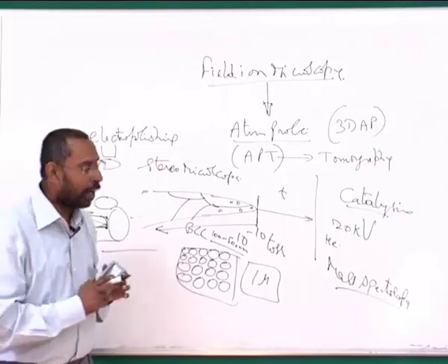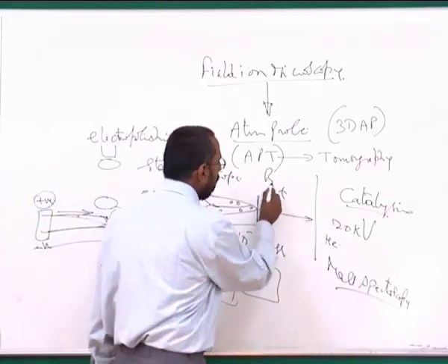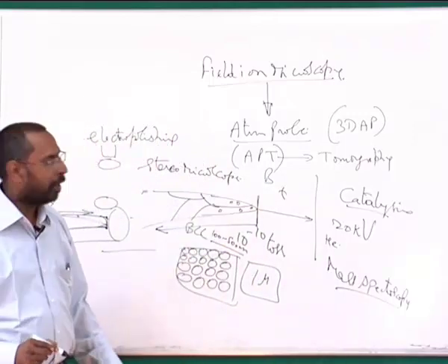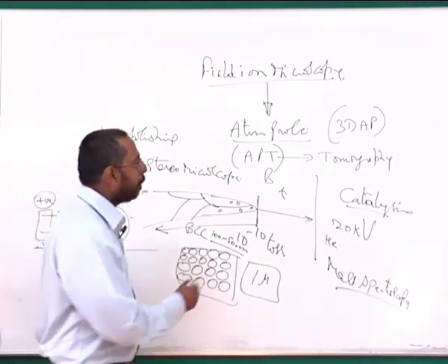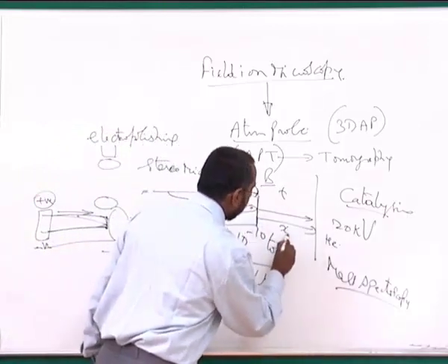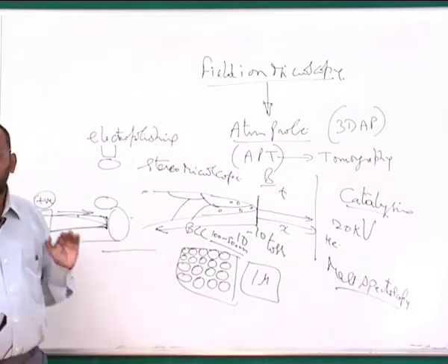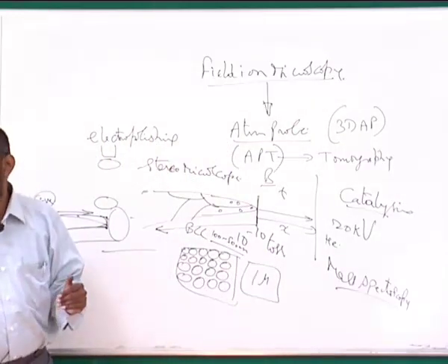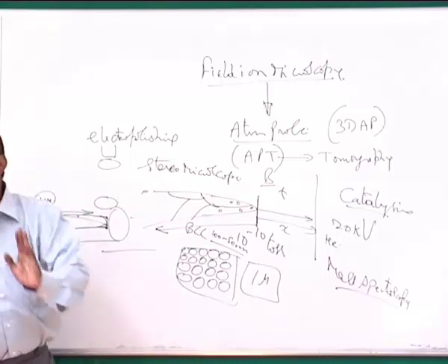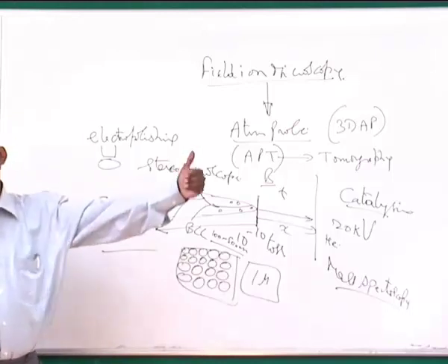Because we know what is the time taken for each of the atoms. For example, if there is boron inside the material, and we know its atomic number, then for that particular atomic number, the time it takes to travel a certain distance x is known. So knowing the smallest atomic number that I would like to detect, you can wait until that particular time, and if no atom joins, that means that particular element is not there, so you can start with the second pulse.